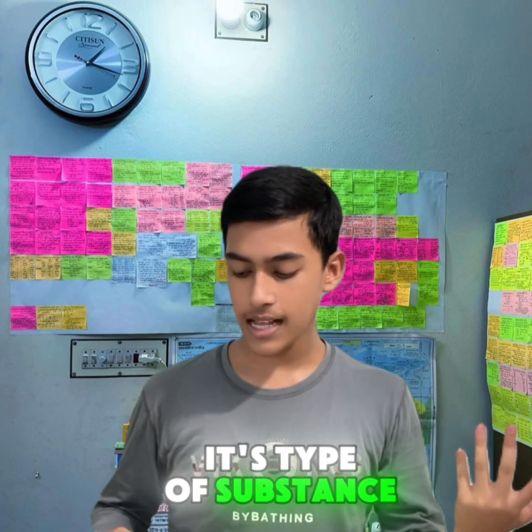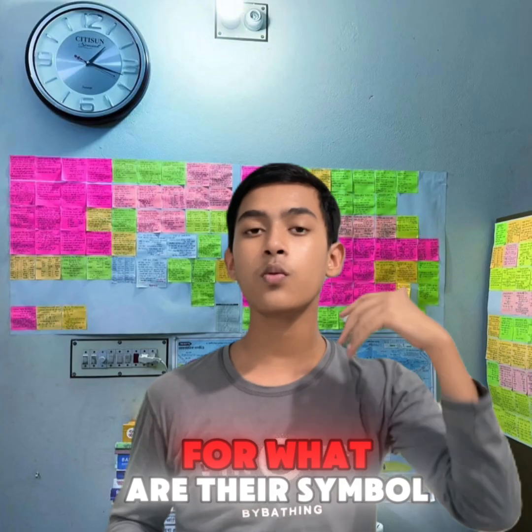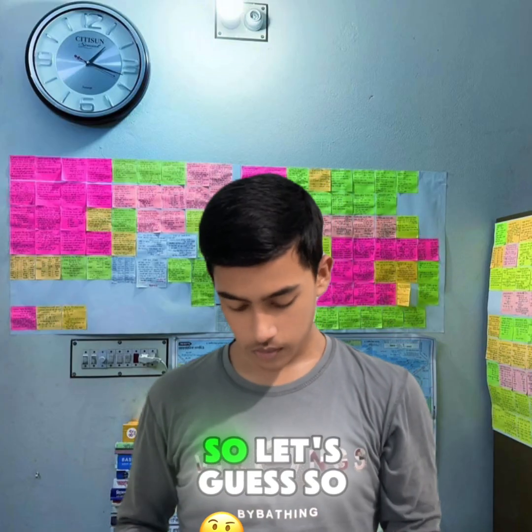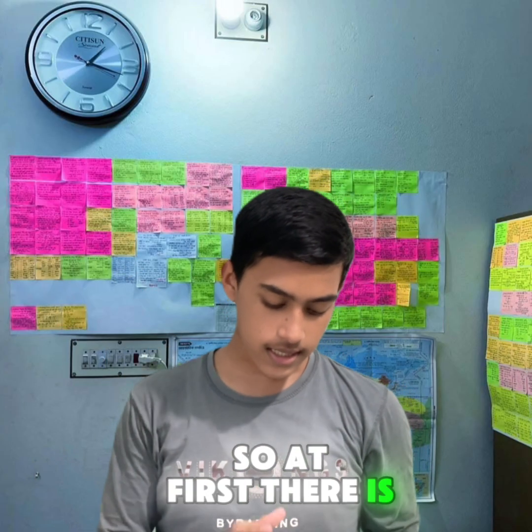After that, there are different types of substances, what they are used for, and what their symbols are. So let's describe them in front of you. At first there is the explosive substance.